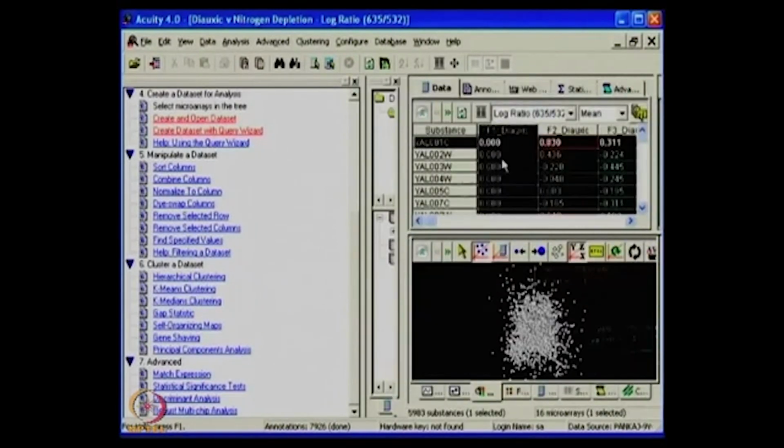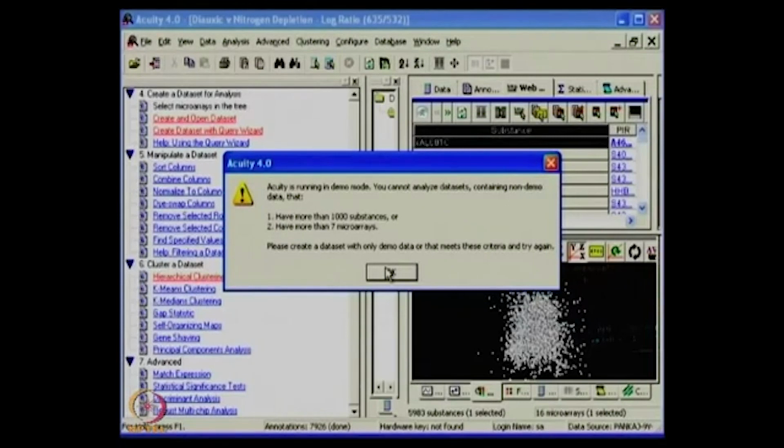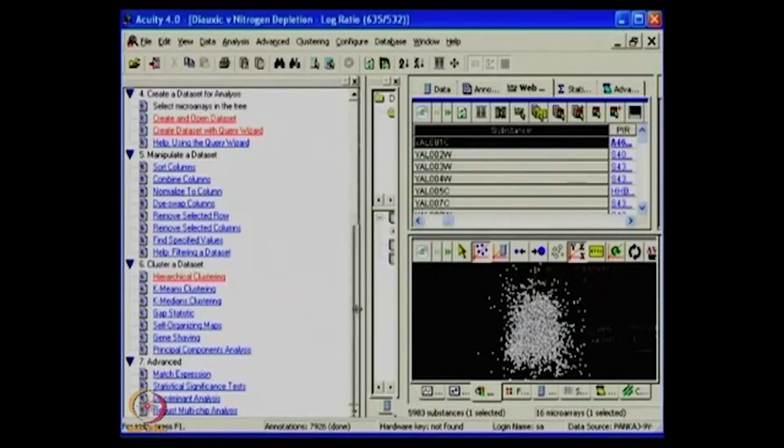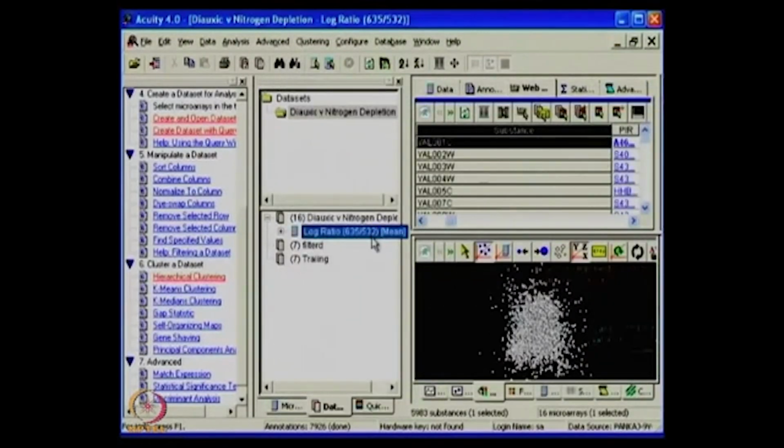And another important thing is, whichever is something like bluish in color, that particular one you have selected to work with. So this is actually filtered data that you are allowed to work with. And when I hit a kind of clustering possibility, it says you need to create a quick data set. The meaning of that is you have half the data already in hand, but now what you need to do is look at a third tab, which allows one to look in the form in which you want to create the data set you want to analyze.